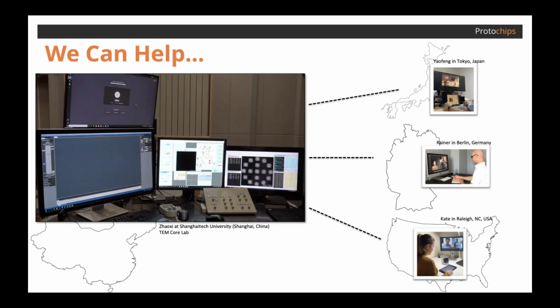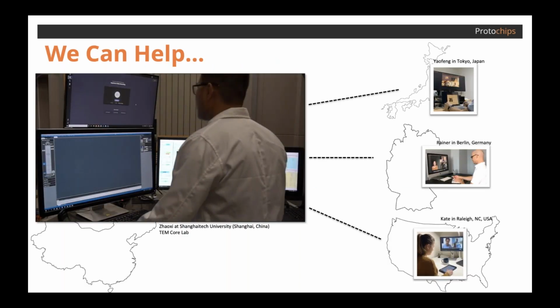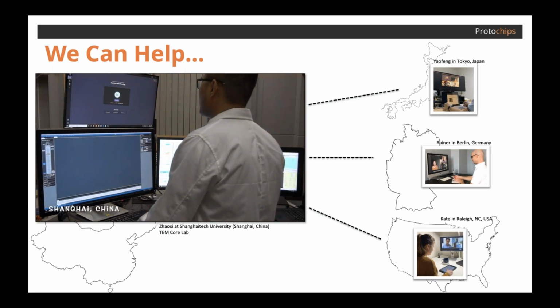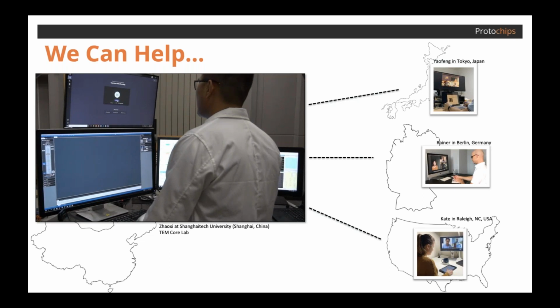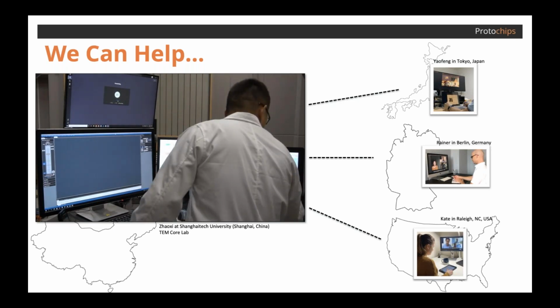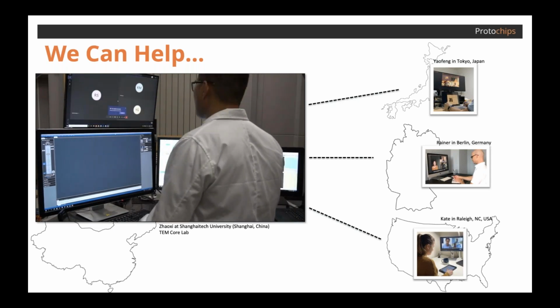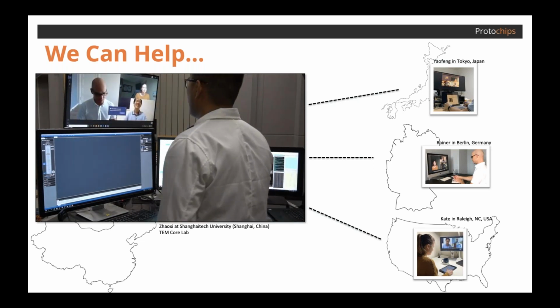And we think we can help. Our new AXON software takes those devilish details that make the remote sharing incredibly frustrating and eliminates them. Whether you live down the street or across the world from the lab you want to collaborate with, AXON can make it a much more straightforward and enjoyable experience for everyone involved.